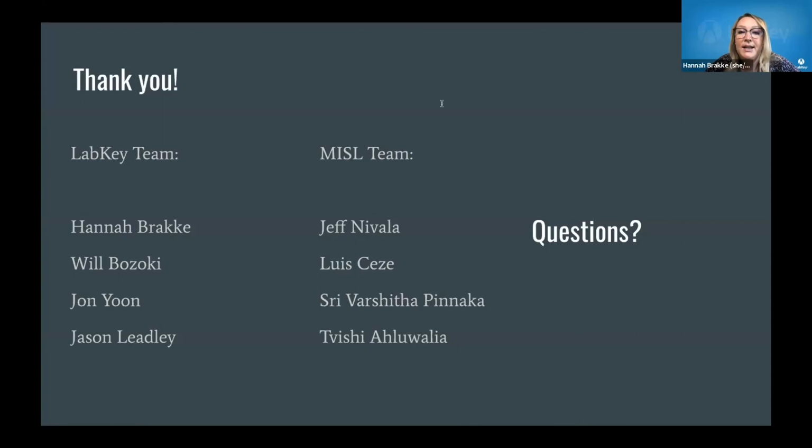And then another question here: how did you handle getting your older samples into LabKey? Maybe a secondary question to that, did you relabel the old tubes, or did you just start the process with new samples? That is a great question. We have a lot of different sample types. Some of them were easier to get into LabKey than others.